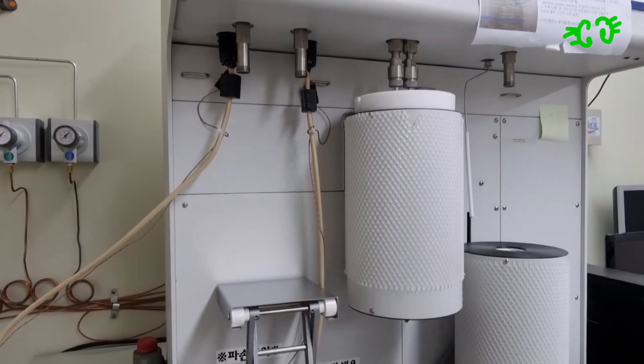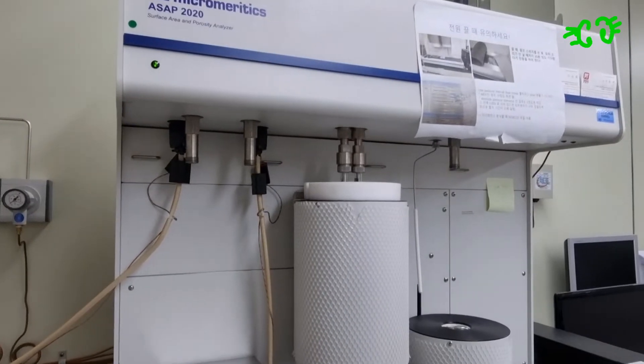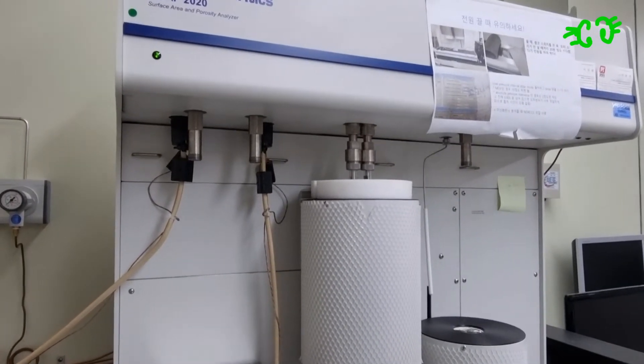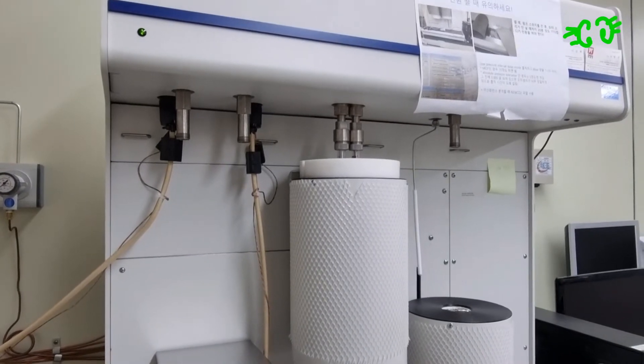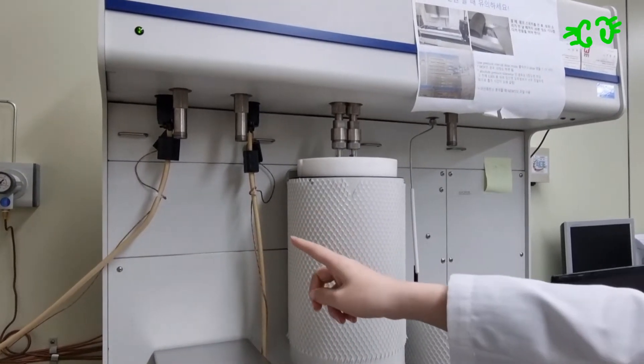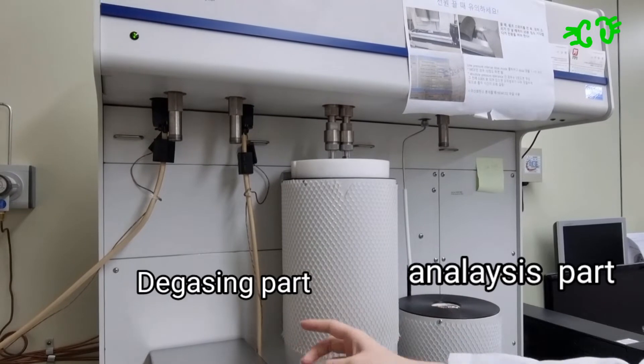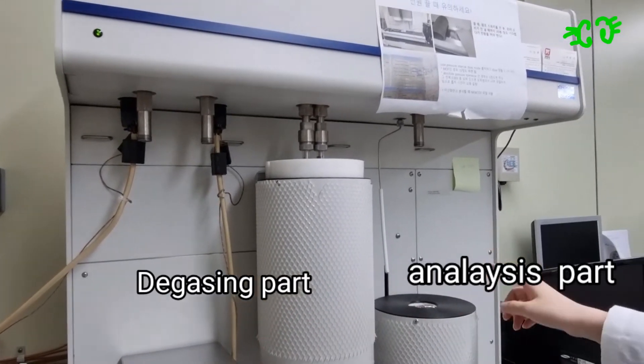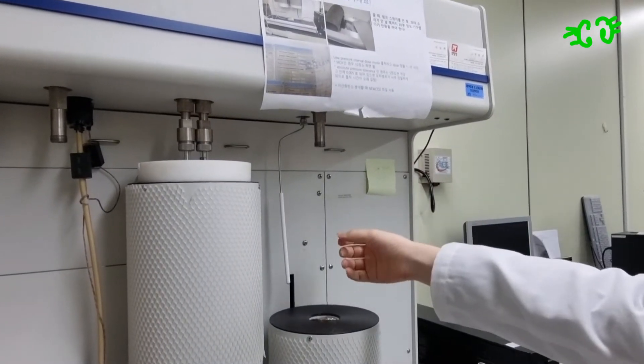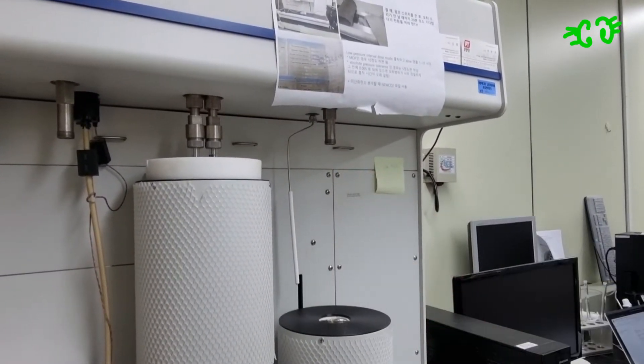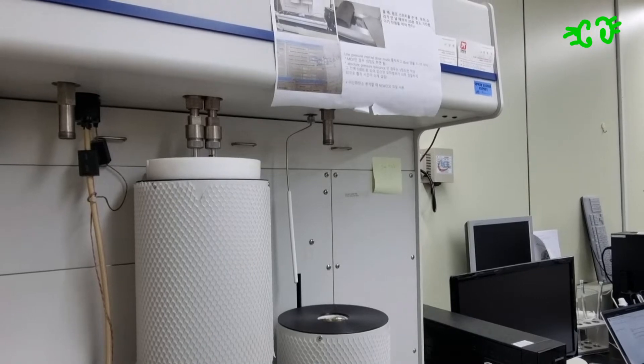There are two parts in ACP 2020, and here is the first part. We call it the degassing port, and we have two ports, so we can degas two samples at the same time. Here is the analysis port, so we can put a sample tube in here to analyze what we want.